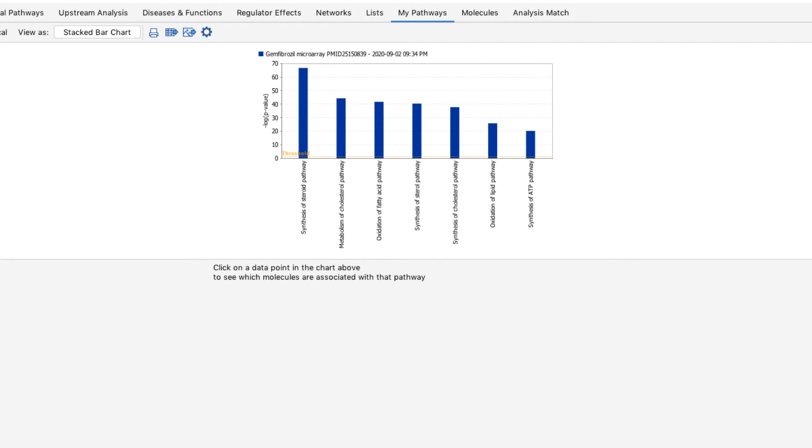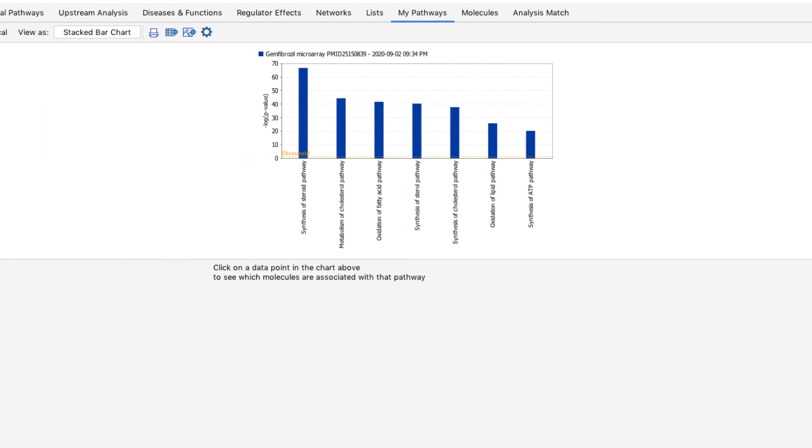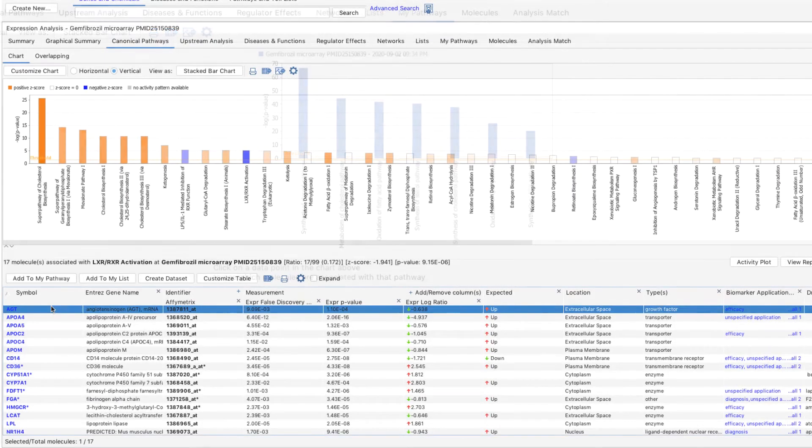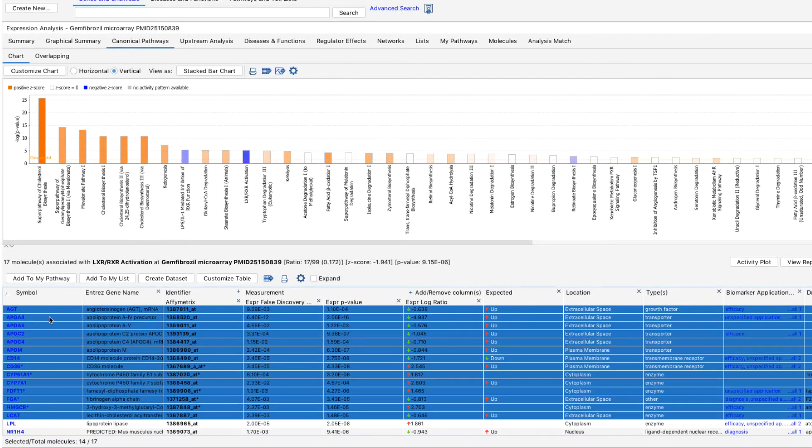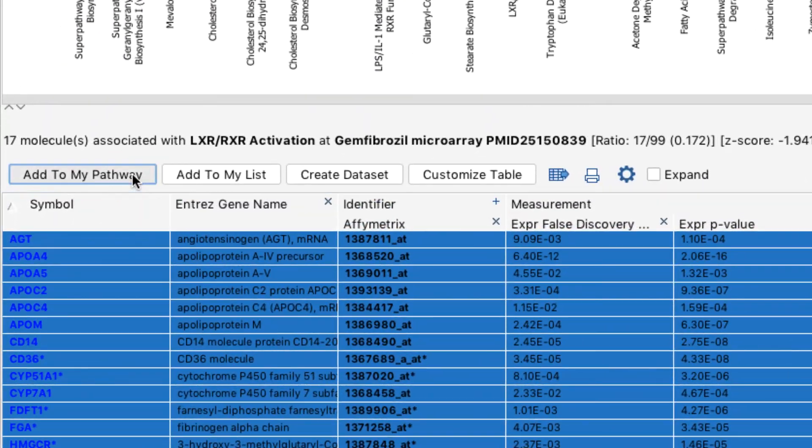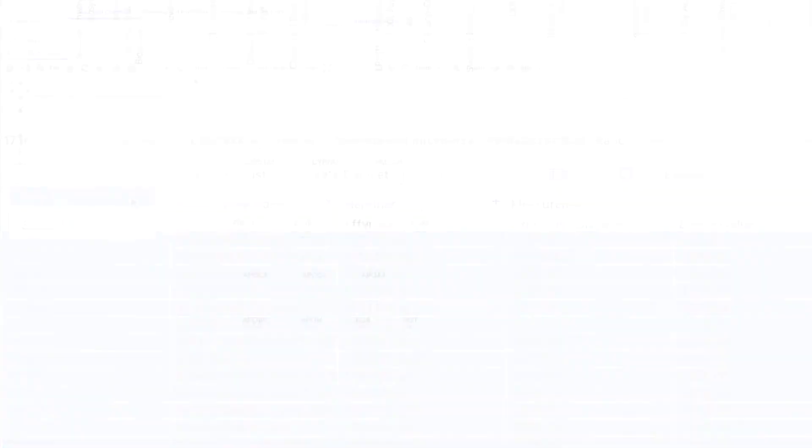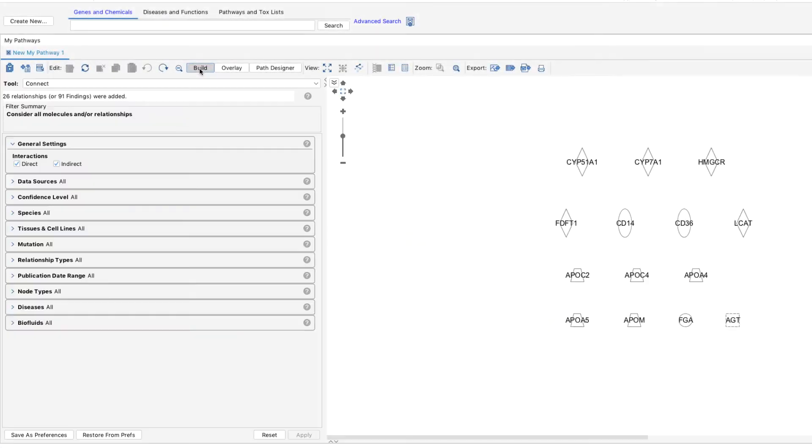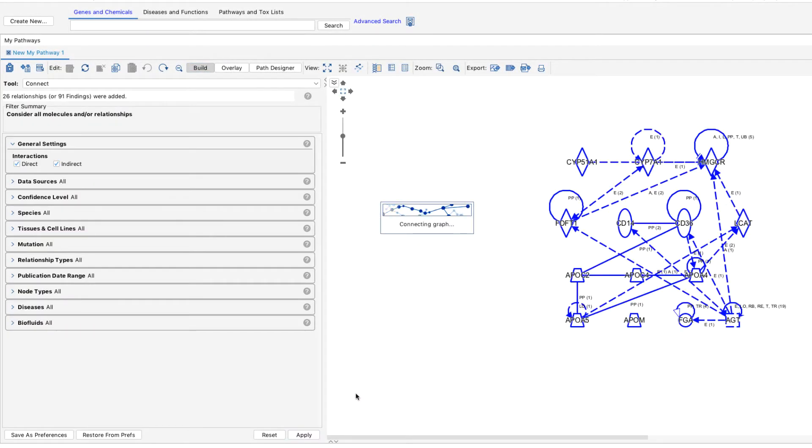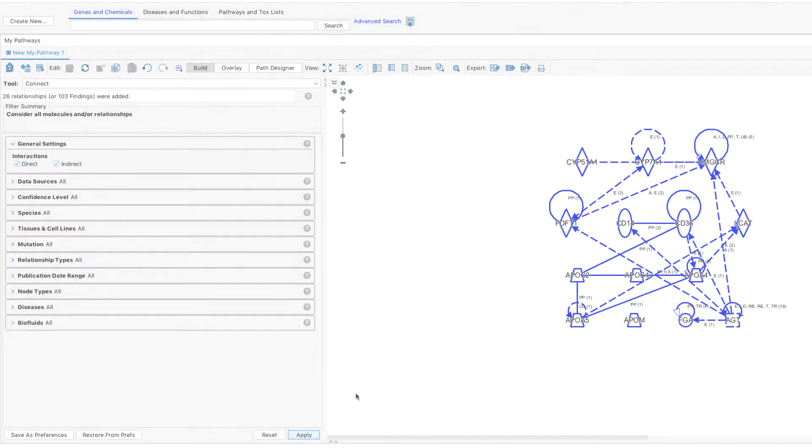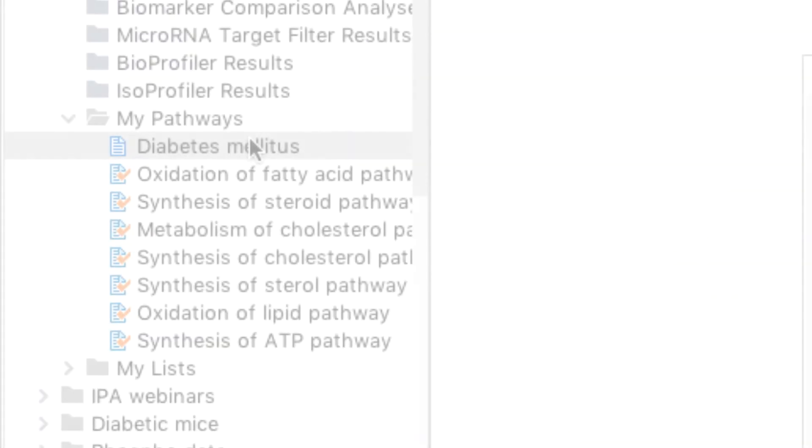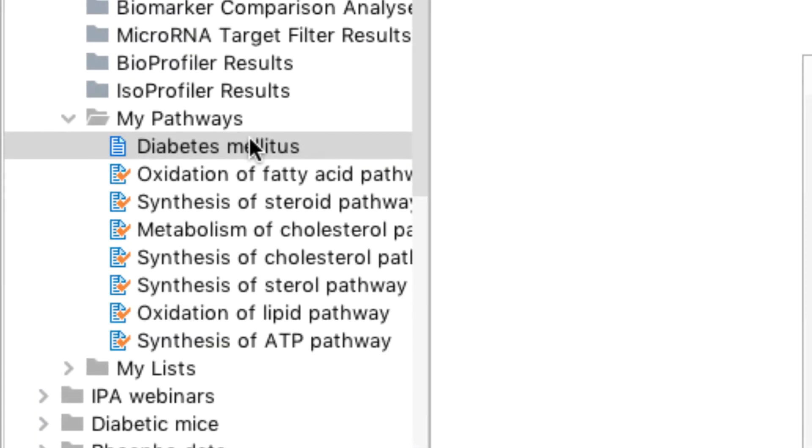There are many different options for creating your own pathways. For example, you can add one or more molecules at a time to a new MyPathway from a core analysis result and use the build and overlay tools to customize your network or pathway. Your saved MyPathway will appear in the Project Manager in the MyPathways folder associated with your project.